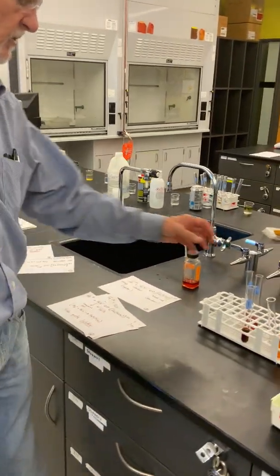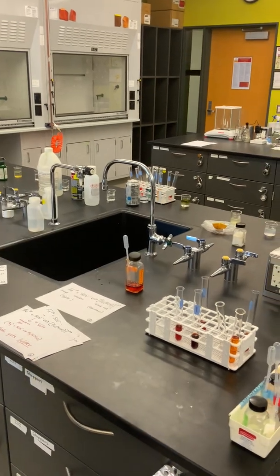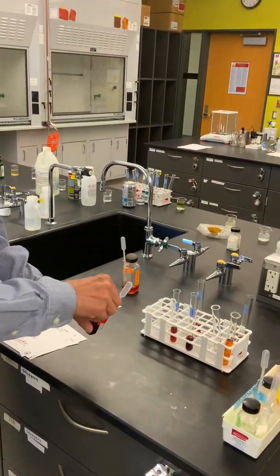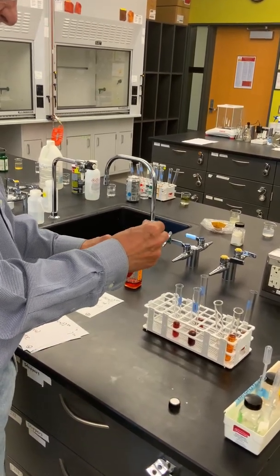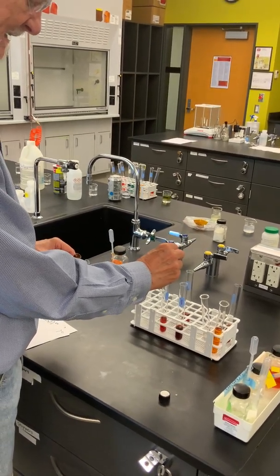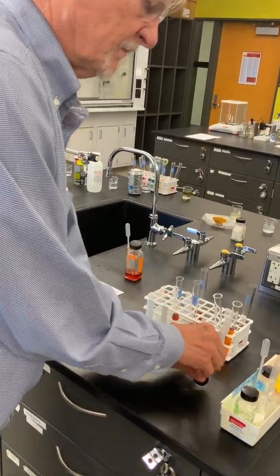It's very difficult to remove ions from solution directly, and so what we have to do is resort to kind of a chemistry parlor trick. In this case, I'm going to introduce some silver ions that are going to scavenge some of the thiocyanate ions out of the equilibrium solution.